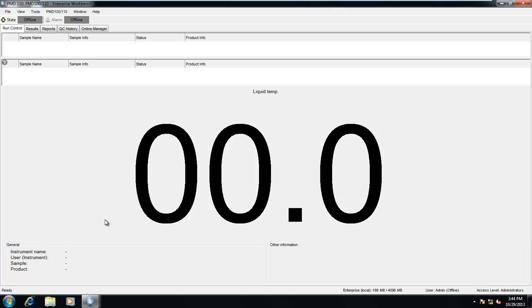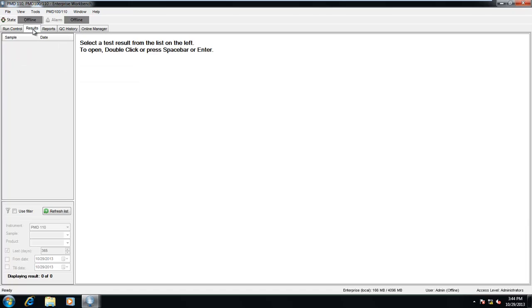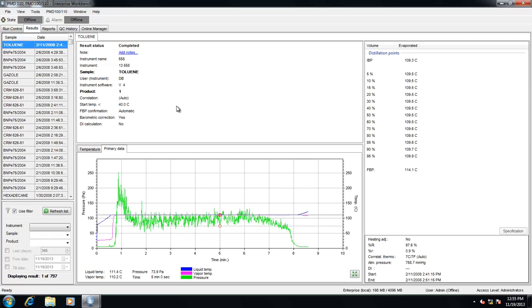Once a sample is recorded by IRIS, it will be available to our user through the results tab. By default, IRIS places the last recorded result at the top of the list on the left-hand side, with all previously recorded results appearing in chronological order. IRIS breaks apart sample result information so that it's easy for the user to find — the top window shows sample and product information, the right-hand side contains distillation points, and the bottom contains graphs for temperature curve, pressure and temperature data, residue, recovery, atmospheric conditions, and start and end date and time.